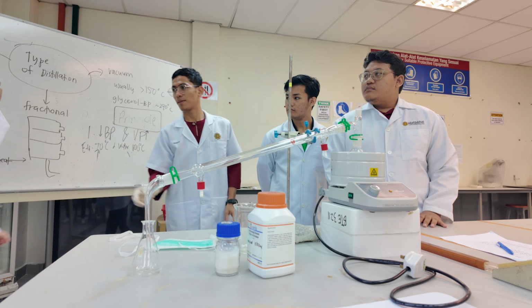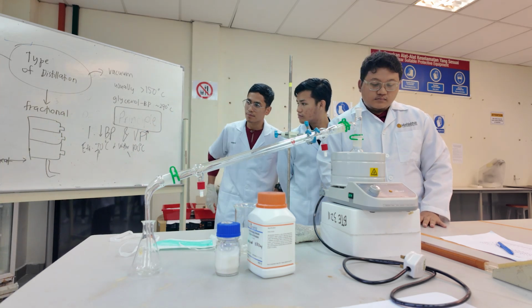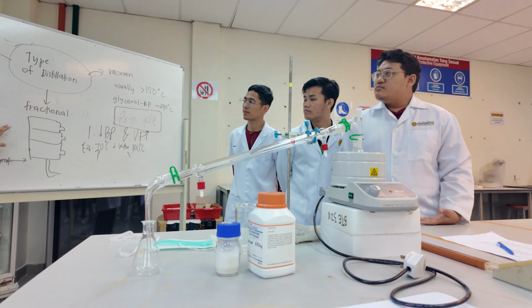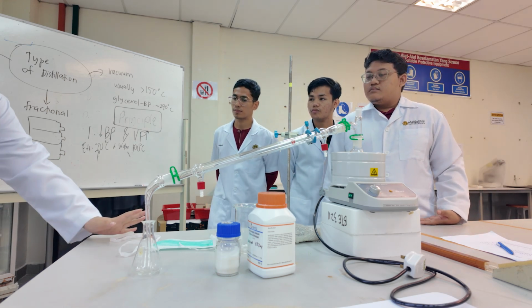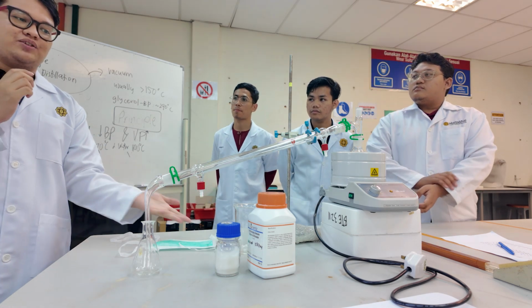Next. Okay, in the same scope of principle, we also need to talk about, back to the simple distillation, and also fractional distillation. As we can see in front of you guys, we have the simple distillation equipment.